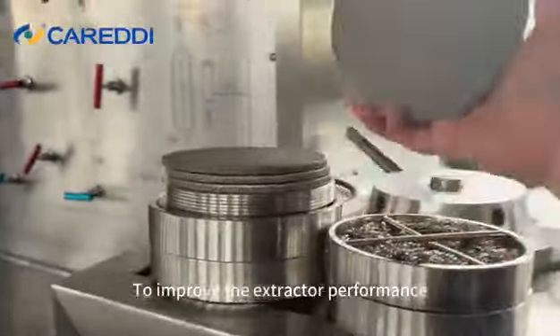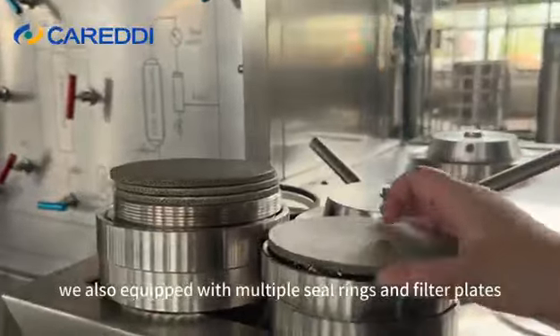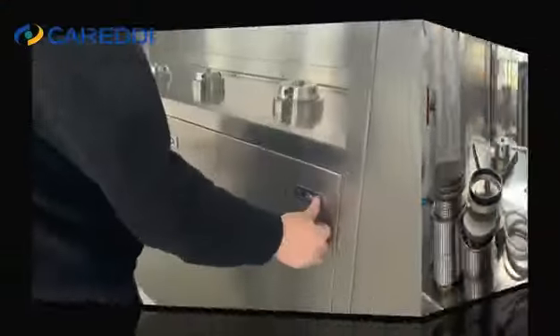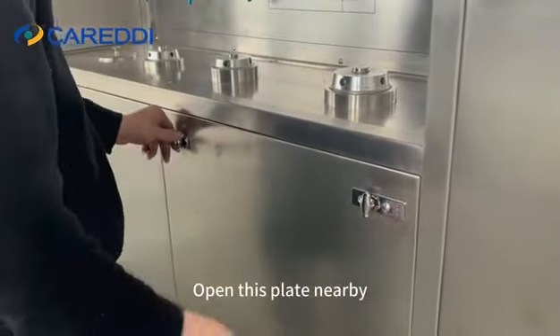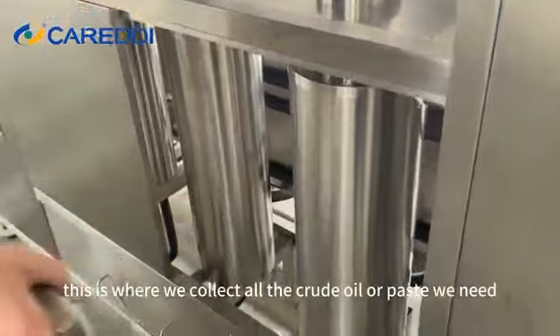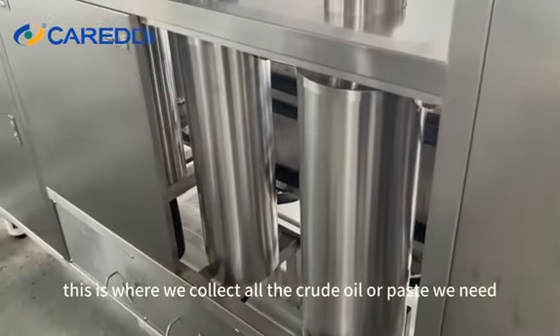To improve the extractor performance, we also equipped it with multiple cylinders and filter plates. Opening this plate nearby, we can see the two separators — this is where we collect all the crude oil or paste we need.